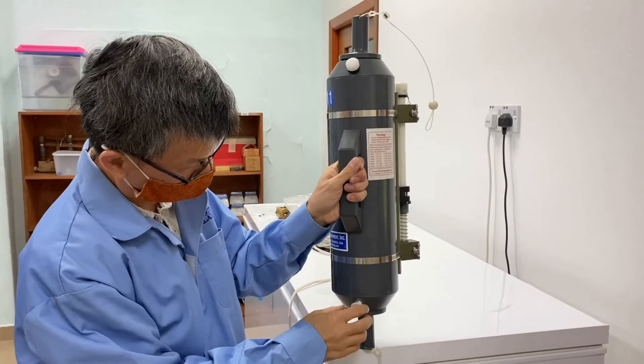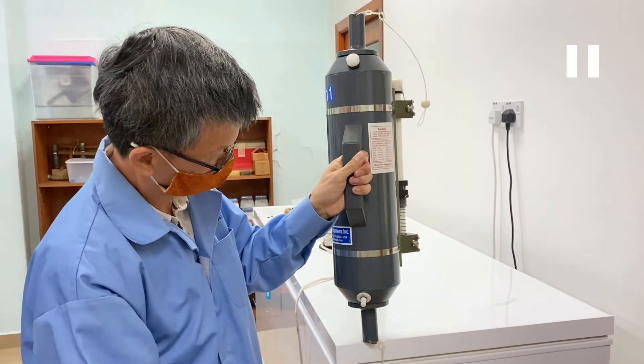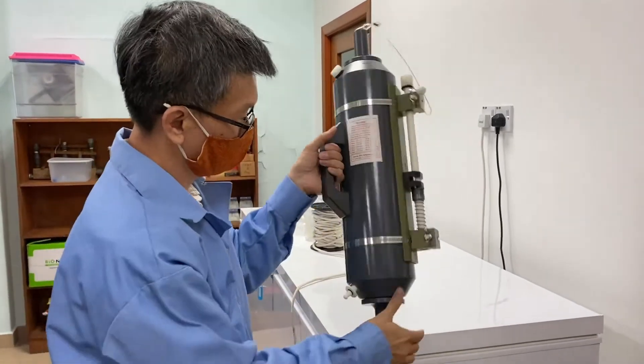You release this valve first so that there is no negative pressure, and then you can collect the water from here. Then you can close it back and close the valve.